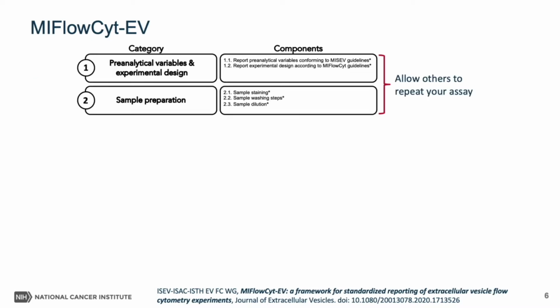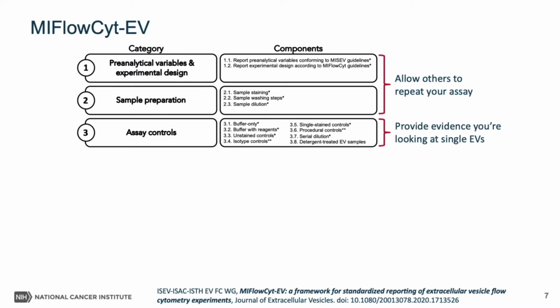So just to give a quick breakdown of this framework, the first two components are designed to report the assay metadata and include the existing MISEV and MIFlowCyt standards. This also includes some sample preparation steps. The third component focuses on reporting and demonstrating assay controls.